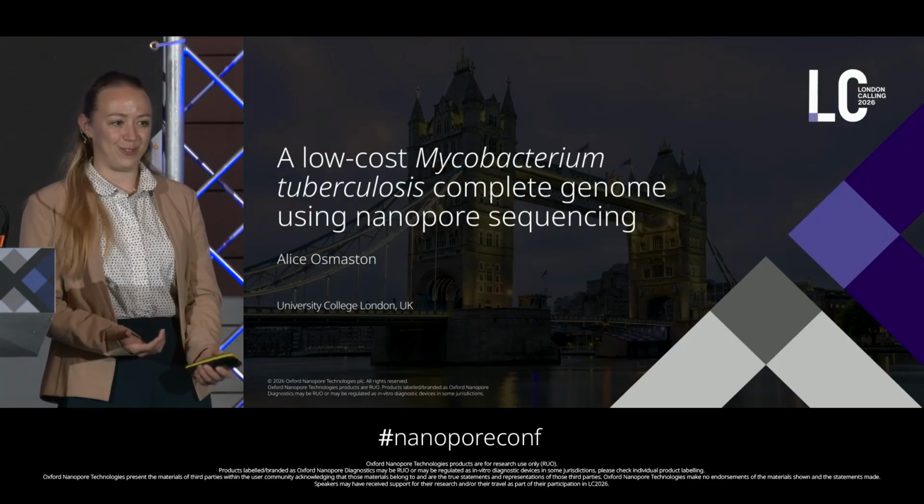So I'm happy to be sharing a pipeline that we've built out to enable us to now get a low-cost and high-throughput complete Mycobacterium tuberculosis genome. And for that, we're using, obviously, Nanopore technology.